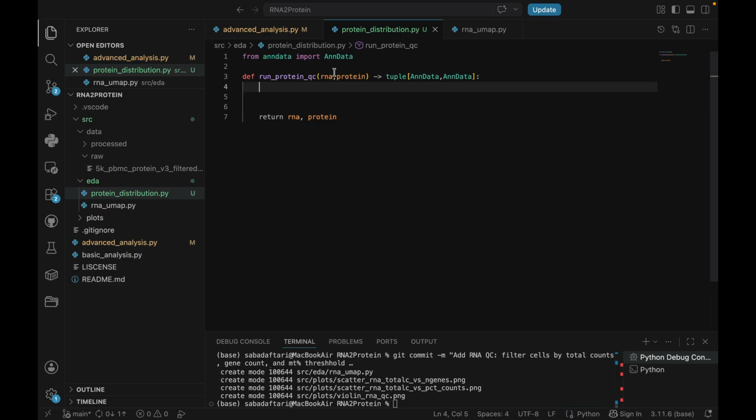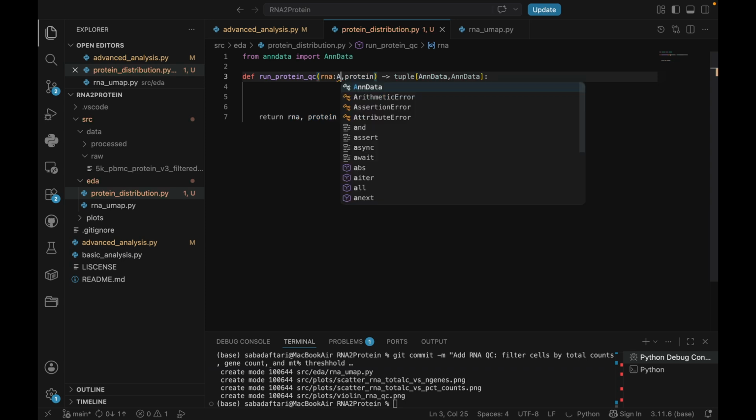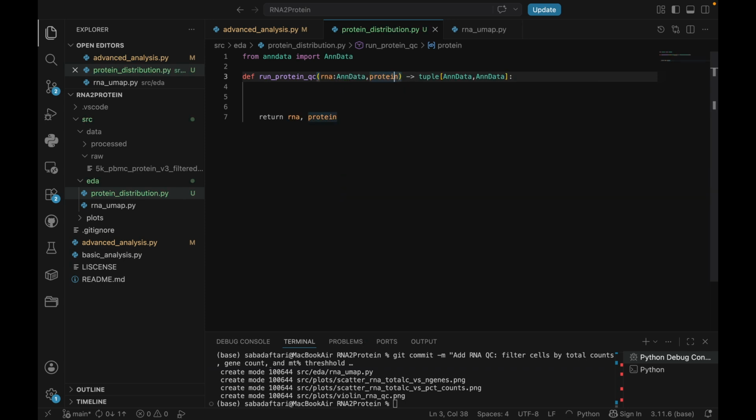And also maybe here. These are software engineering standards. It's good to have it, even if you're just researching, so in case things go into production, you have it easier.